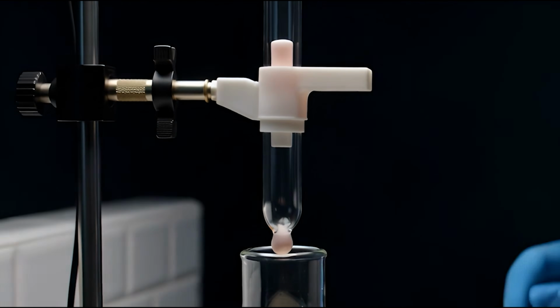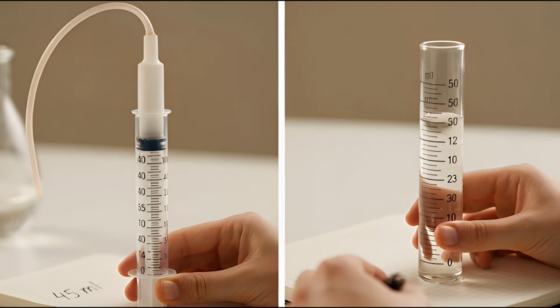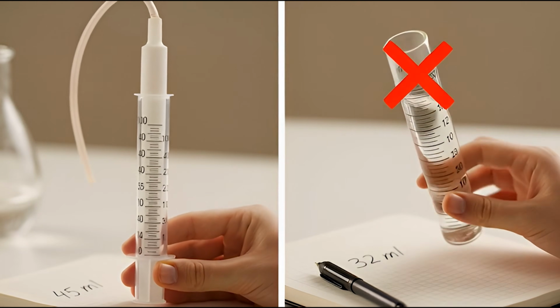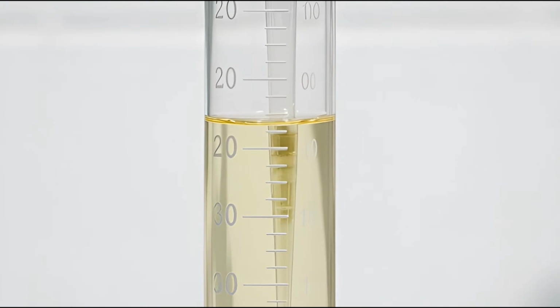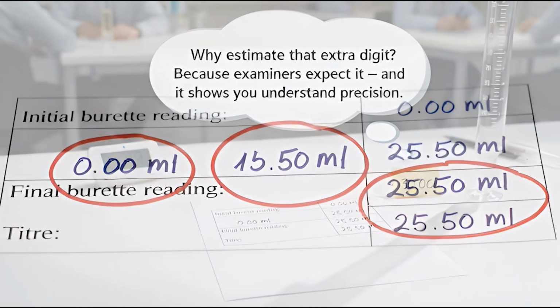Titration, the classic quantitative task. One drop changes everything. Watch the meniscus. Gas syringe, measuring cylinder, always read at eye level. Parallax error kills accuracy. Burette readings, always estimate to half the smallest division. That extra digit earns marks.